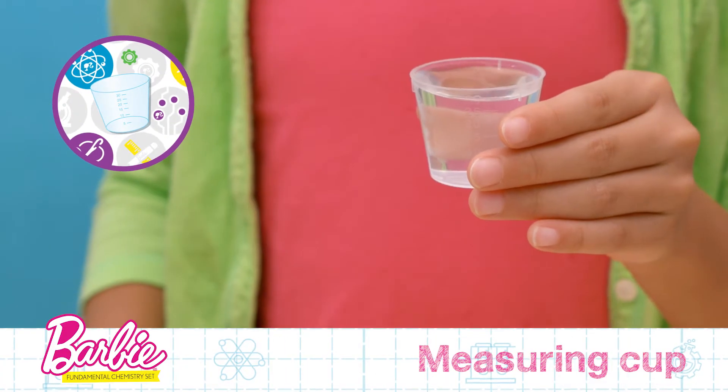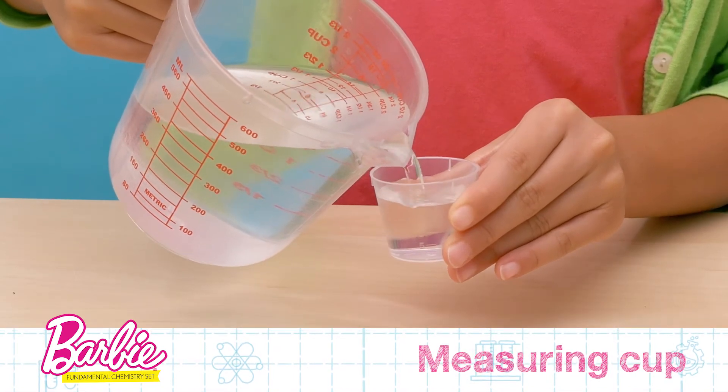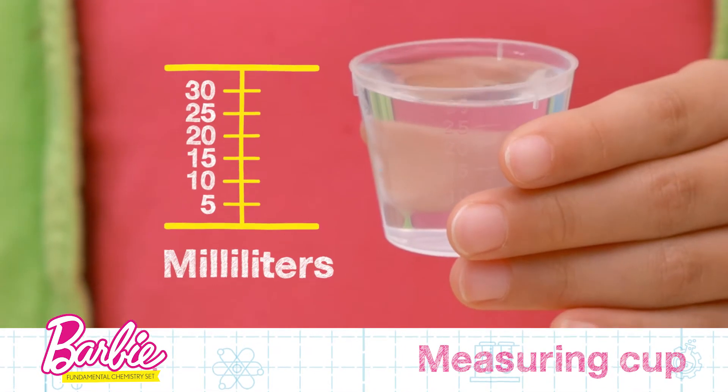This is a measuring cup. The measuring cup allows you to correctly measure powders and liquids, showing the volume in milliliters on the side.